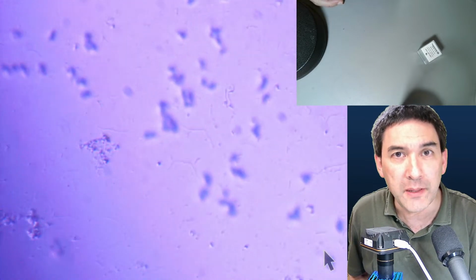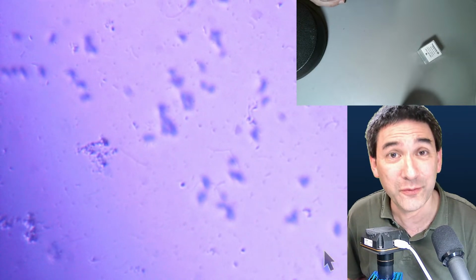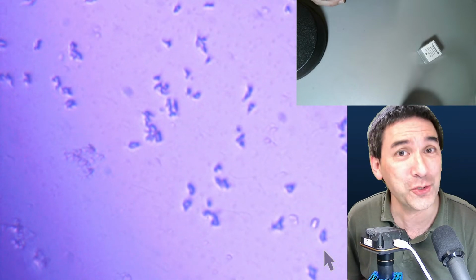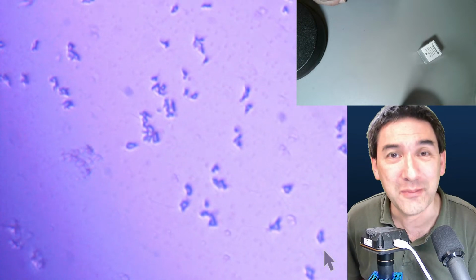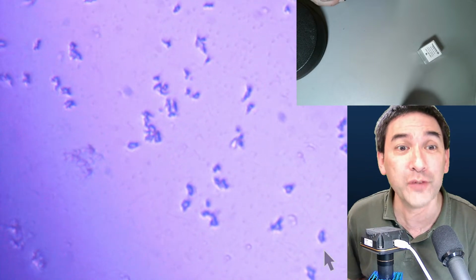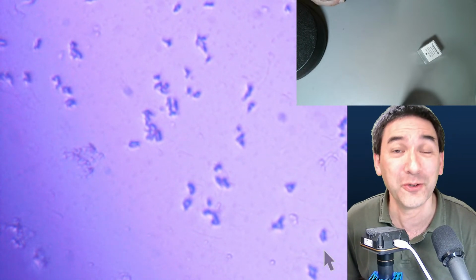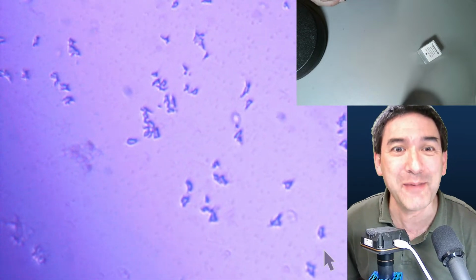But actually it's not wrong. The magnification depends on the size of your monitor or on the size of your mobile phone screen. Now some of you might be a little bit surprised, right? Because the larger your screen or the larger the video that you're looking at, the larger the magnification. Because magnification is the size of the image that you see on the screen divided by the original size. So if you ask me what magnification it is, I wouldn't be able to tell you because it depends on your monitor. Now, this is not a satisfactory answer, and maybe not an answer that you expected.